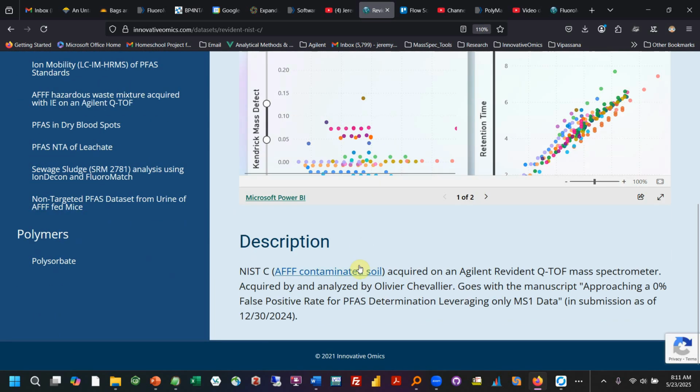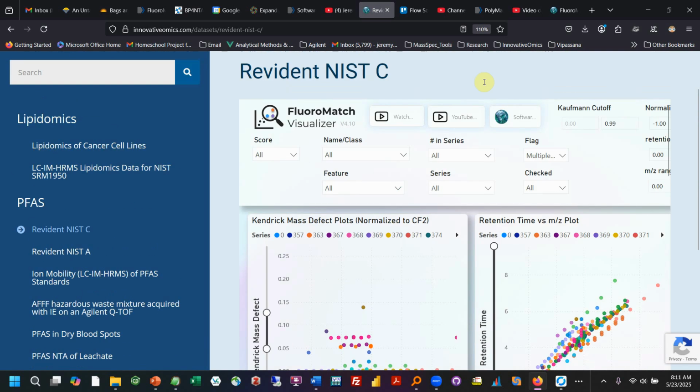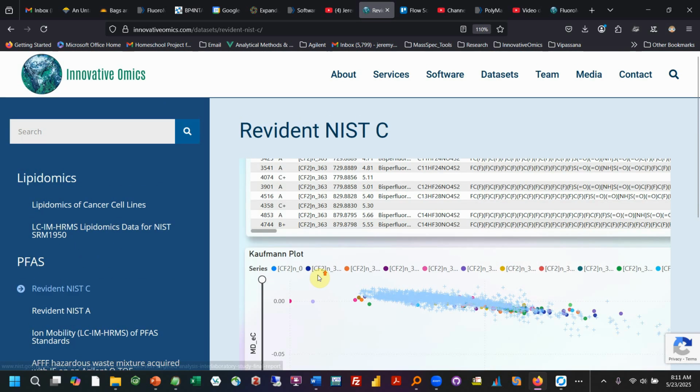And of course, with it, you can put your manuscript if you want. You can put any acknowledgments, the authors, so on and so forth with this data set. Because it's just a web link, you can put whatever you want. You can have links to your own website, so on and so forth.